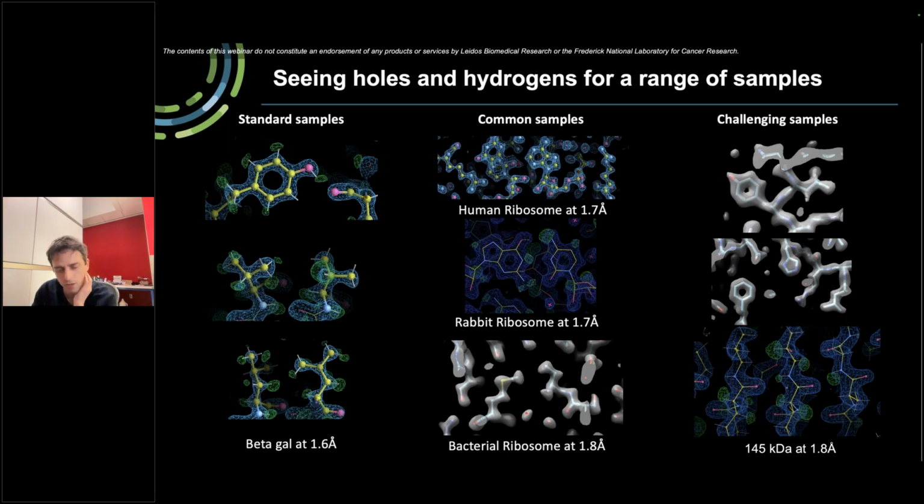So just as an example, with one of the data sets here, it was a data set of either 10 or 15,000 micrographs. So not that large by today's standards. So 10 or 15,000 micrographs, and you can get to multiple high resolution structures, but actually 3 different structures from the same data set that are all beyond 2 angstroms. And you could see different things in them. You can see different conformations for things that are actually biologically relevant.